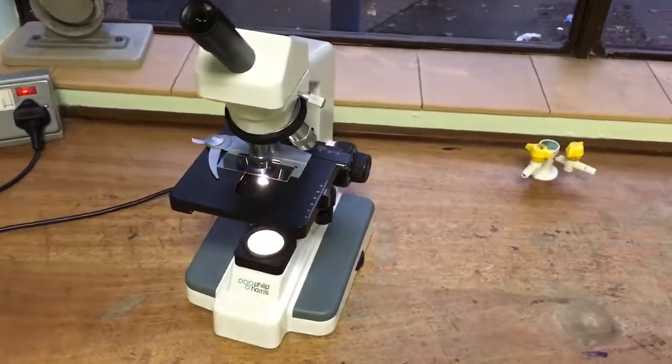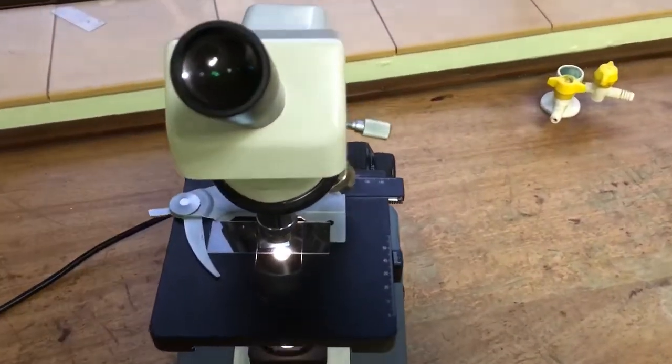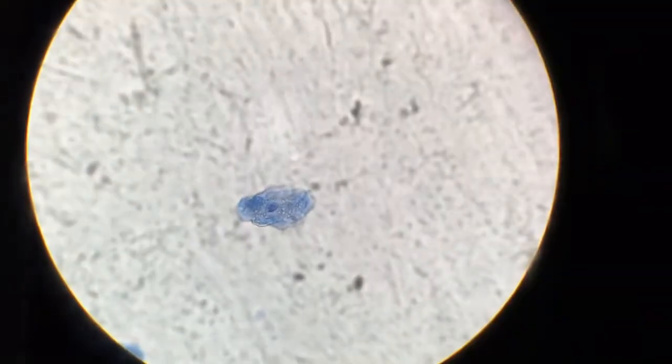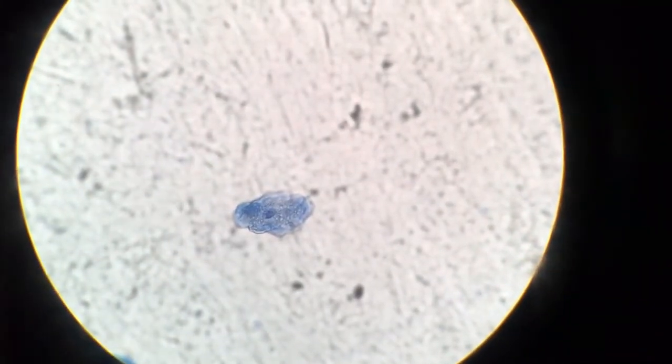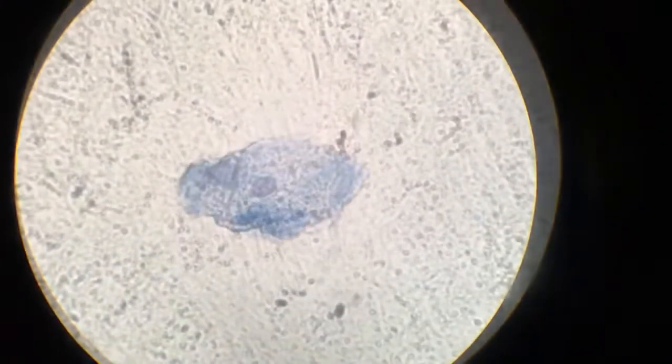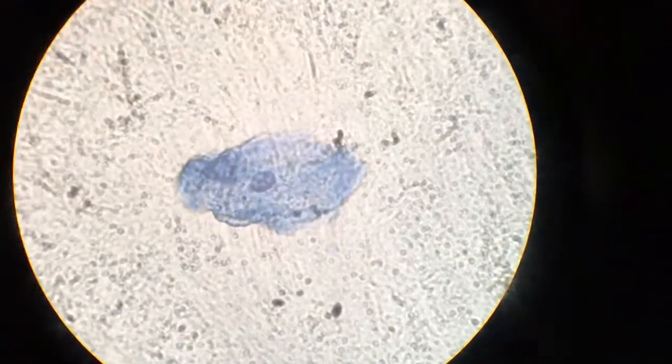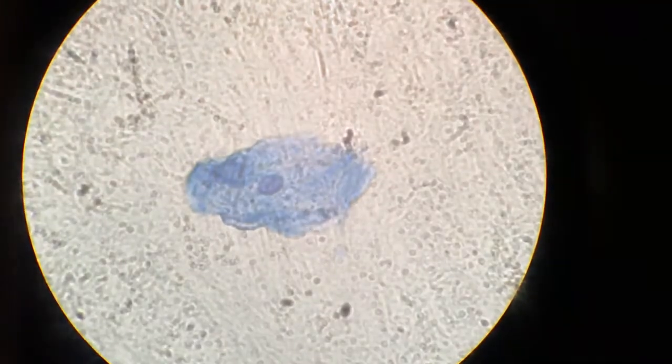And this is what the slide looks like down the microscope view. You can see this is the same cell viewed at an even higher magnification.